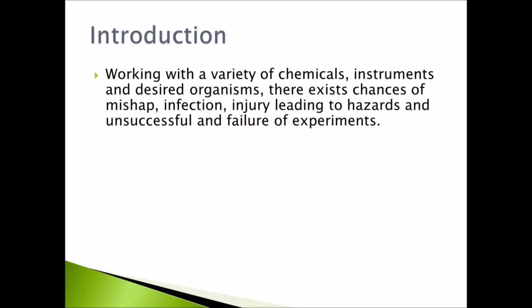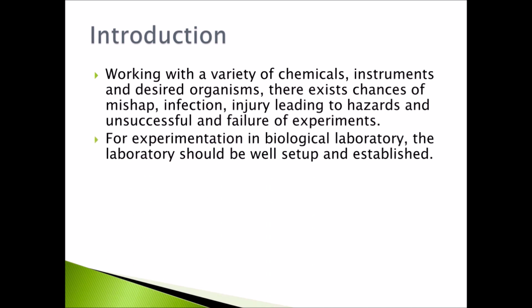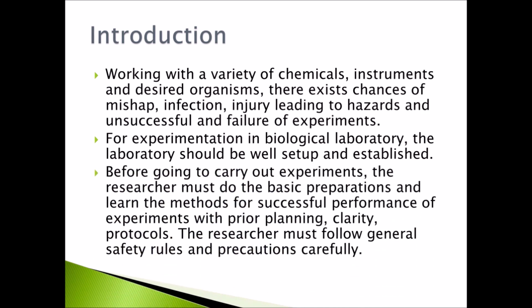Introduction. Working with a variety of chemicals, instruments, and desired organisms, there exist chances of mishap, infection, and injury, leading to hazards and unsuccessful failure of experiments. For experimentation in a biological laboratory, the laboratory should be well set up and established, as I have already told you earlier.